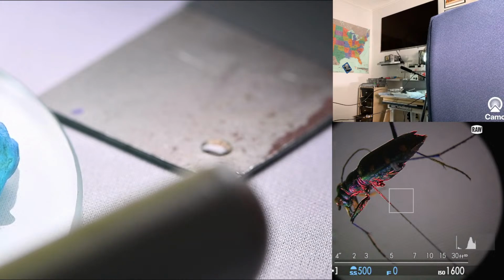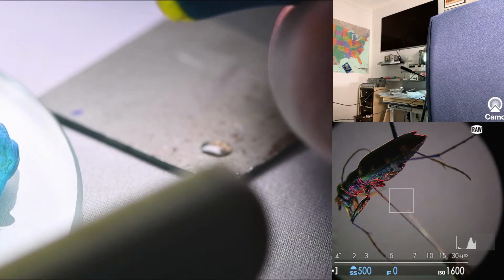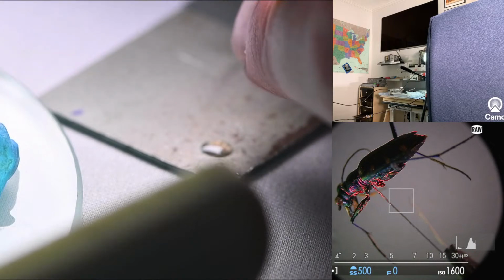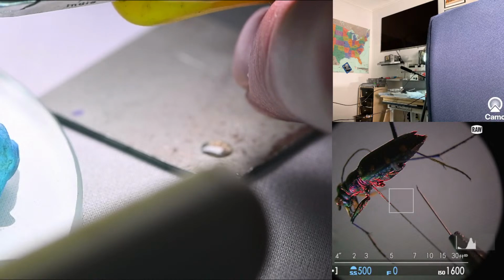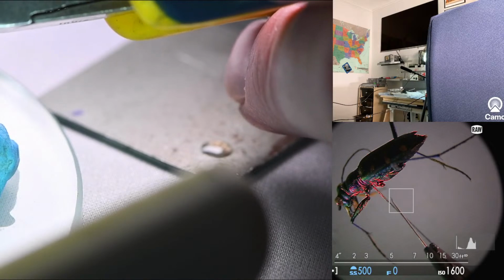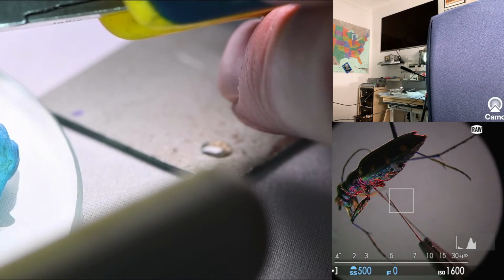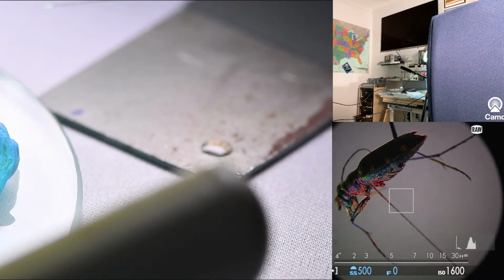And then with the beveled part of the needle facing the stump. Let me show you what I mean. If you look in the microscope view, and I rotate the needle around, you can see that it has a flat part with a hole in it. That's where the bulk of the glue is going to be. That is what I need to apply to the stump, like so. Bang, right on the end there. And that will put just the right amount of glue on.